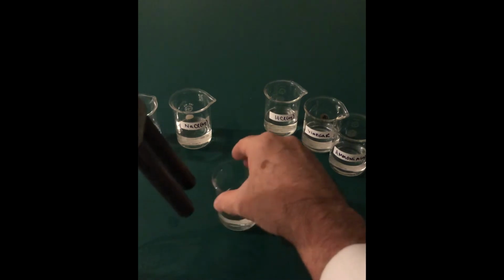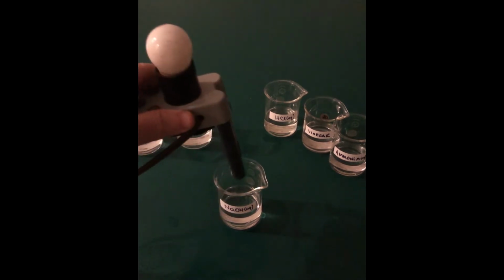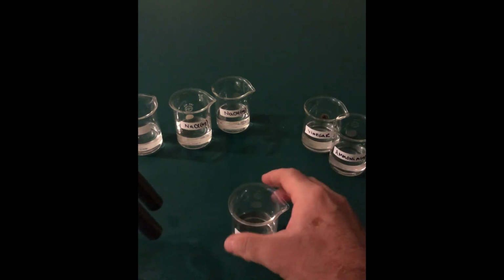So here is sodium hydroxide, NaOH, which in very concentrated form would be Drano in your house, but this is more dilute. Let's see what happens when I probe it with my conductivity tester here. Wow, again, a very bright light, very good. So that means that there is something in there that similarly to sodium chloride causes the solution to conduct electricity. Of course, you know from the formulas, NaCl, NaOH, that we're talking about ions.